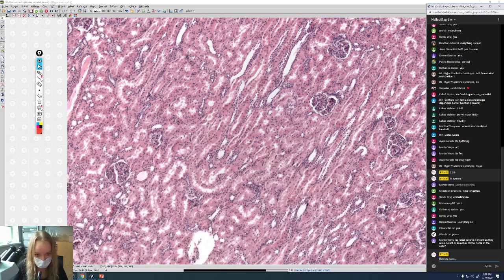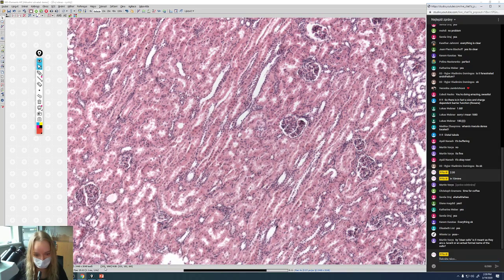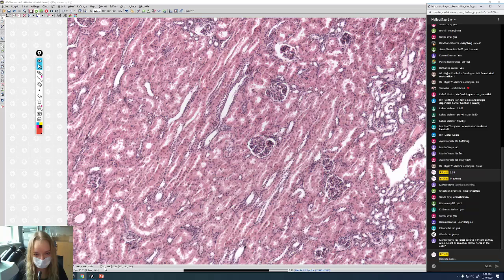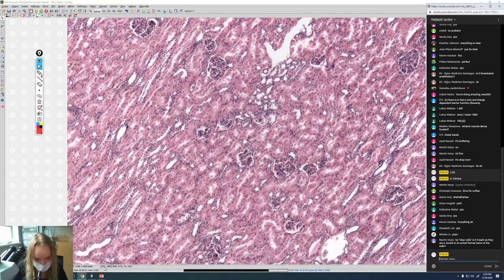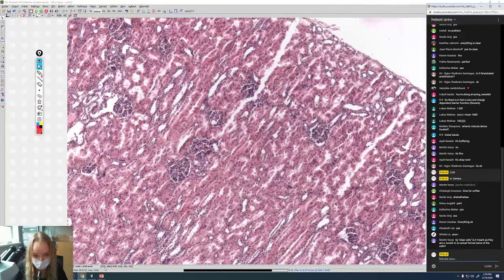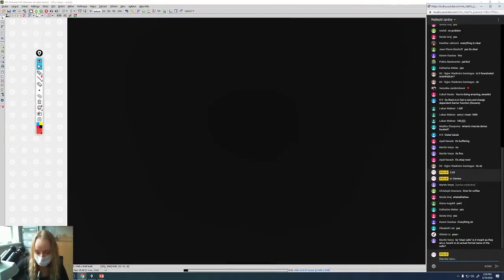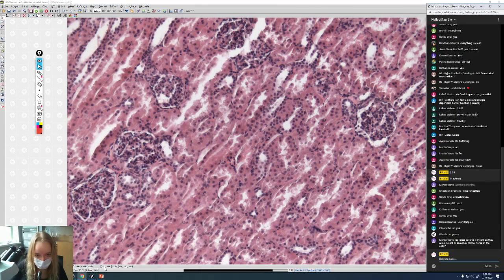And I need a little help, probably there. Where was the good one? It isn't easy to say. We're going to find some good one to describe, maybe in a higher magnification.